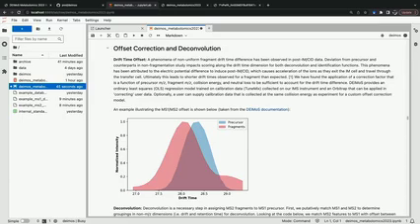And we've noticed that this occurs as the ions pass through the transfer cell, and there's an electric potential difference that causes the fragment drift times to arrive sooner than would be expected.